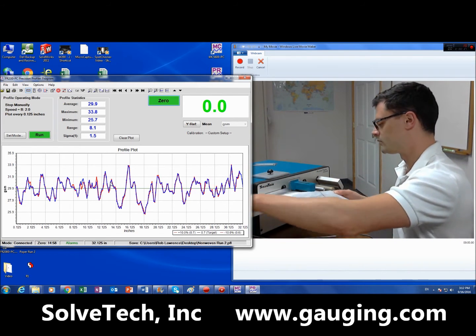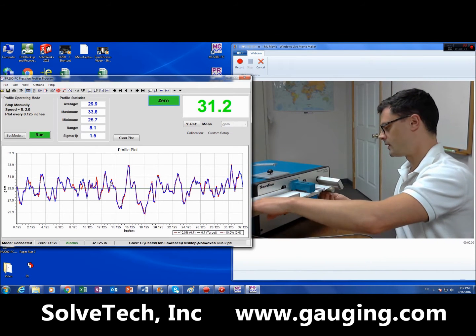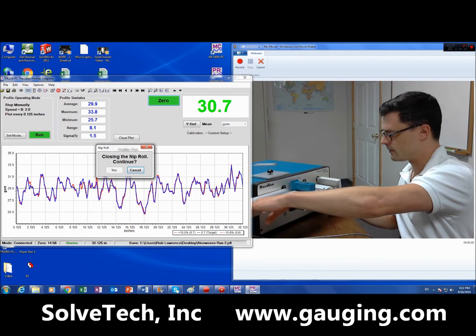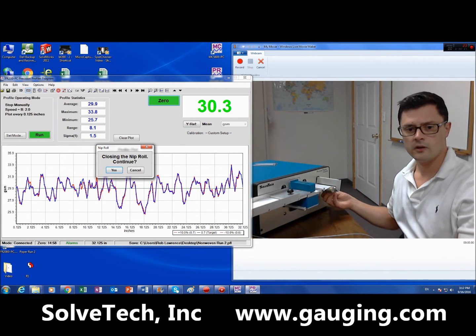I'm reading down to a precision of about 0.1 GSM, and I'm going to go ahead and start the run.